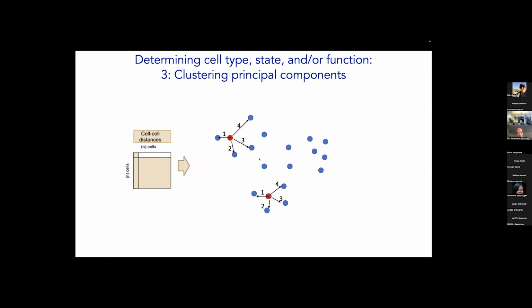And then we do the same thing over here. For every single cell, we ask, who are my nearest neighbors? So I'll show you that again. This is the nearest neighbors of this cell. That's an example for that cell. Now for this cell over here, we do the same thing. Here's its 4 nearest neighbors. And we can keep doing that. And so that's where the little connections come from in this graph.